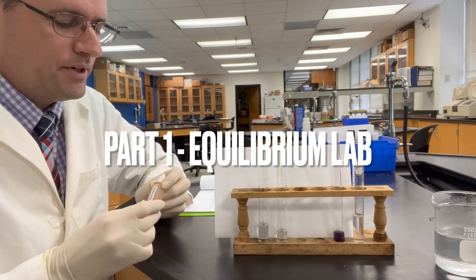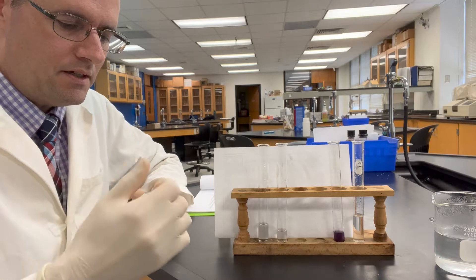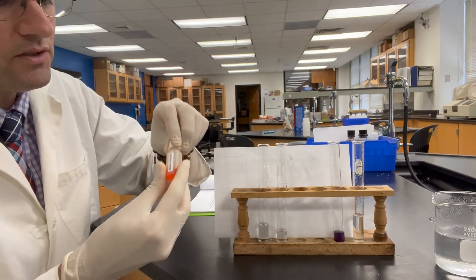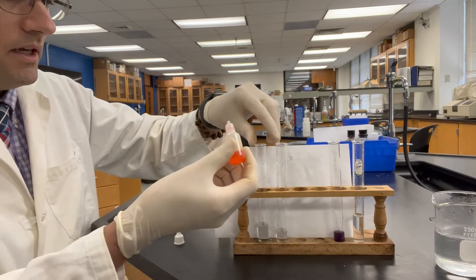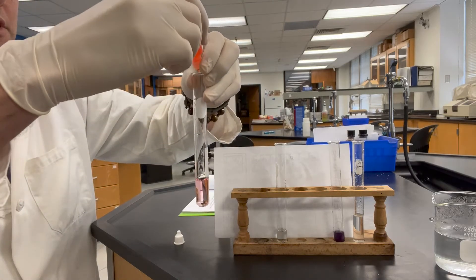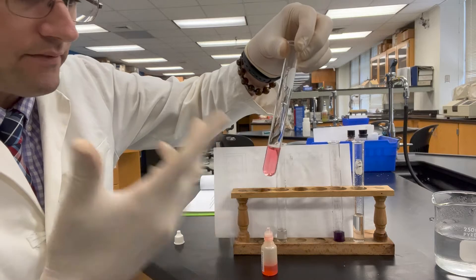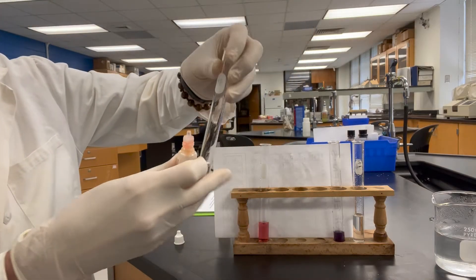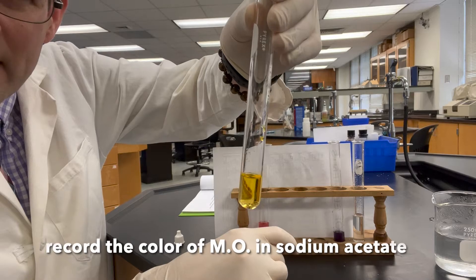For part one, we're going to be using methyl orange, which is an acid-base indicator, to study a mixture of acetic acid and sodium acetate. Methyl orange is kind of an orange solution. I've got 0.1 molar acetic acid on the left — I'll place a drop in here, maybe three drops so it shows up on video. We call that red. And when I add the same number of drops to sodium acetate, we call that yellow.